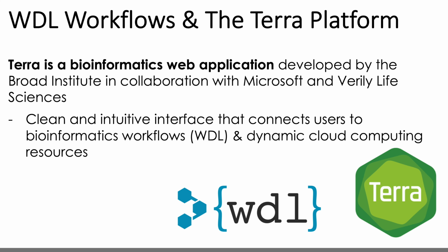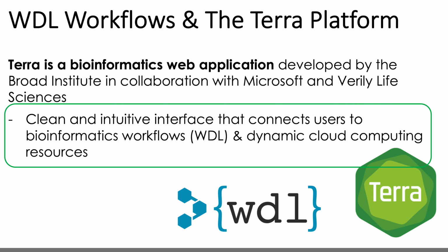For those unfamiliar, Terra is a bioinformatics web application that was developed by the Broad Institute in collaboration with both Microsoft and Verily Life Sciences. And there are tons of educational material on Terra, both technical details and tutorial walkthroughs on how to use this platform. But for now, I just want to provide the 1,000-foot view of Terra as a clean and intuitive web application that connects users to bioinformatics WDL workflows and dynamic cloud computing resources.